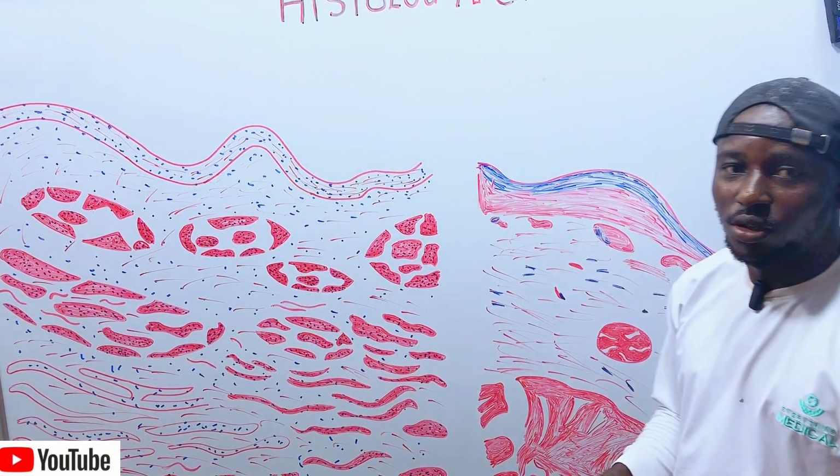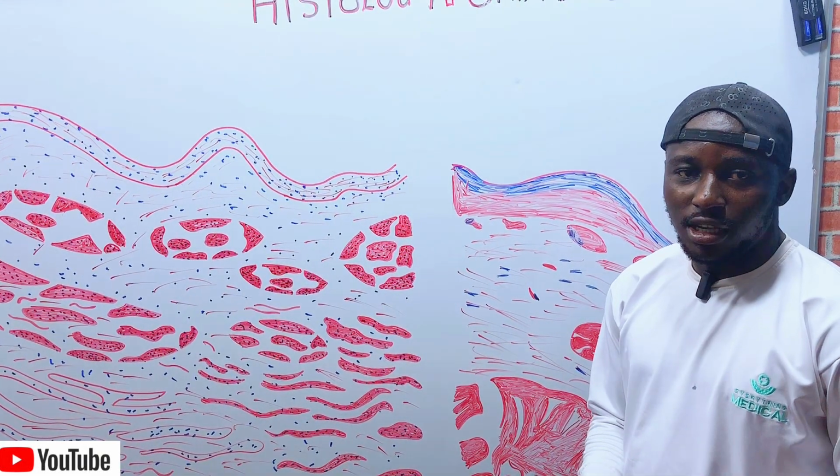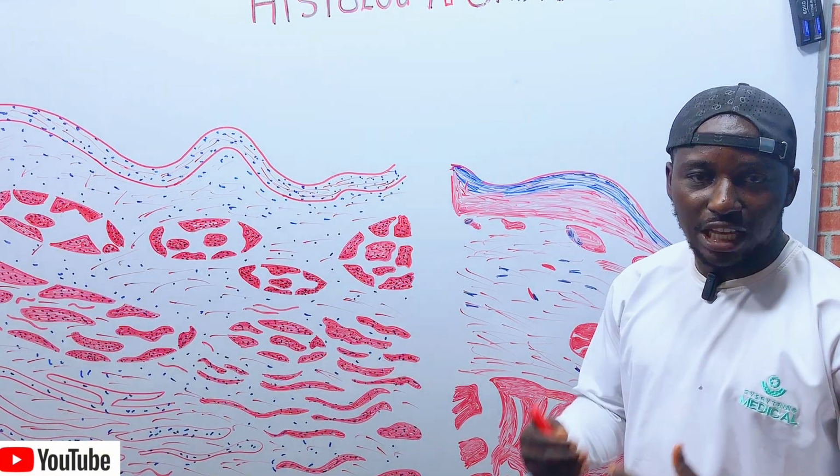Today's video, we shall be appreciating the histology of the urinary bladder. It's an essential histology on the urinary system.